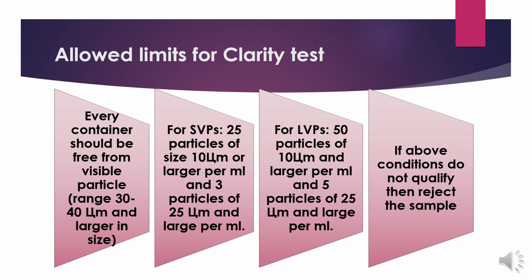It says if the above conditions do not qualify, then reject the sample. So all these are conditions that must be fulfilled. If your product is not fulfilling these criteria, then you have to reject the sample, or if there are visible particles, you have to discard your product.